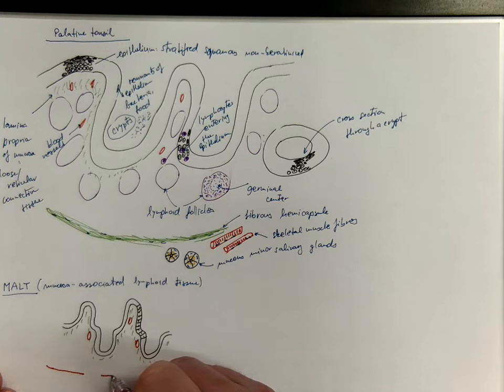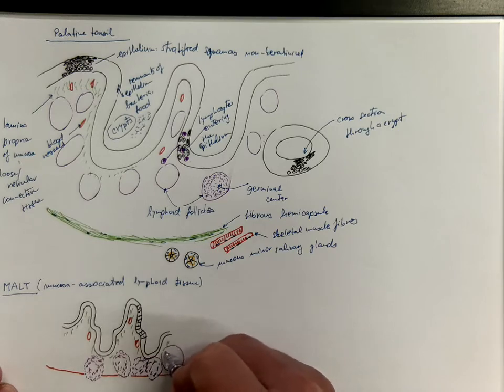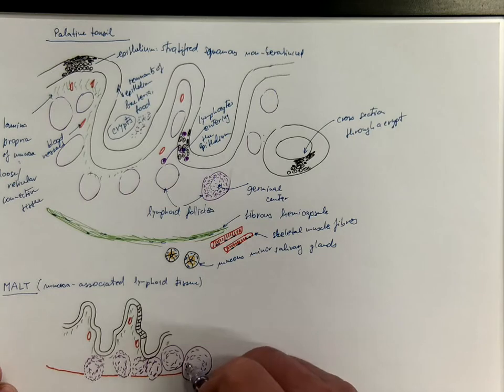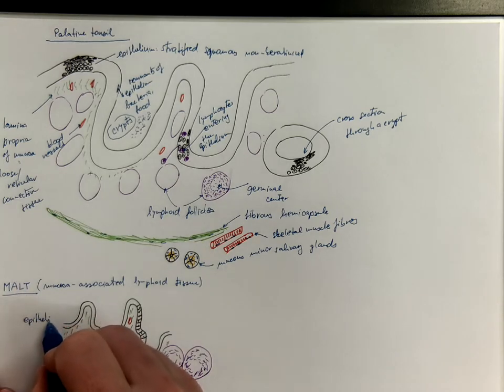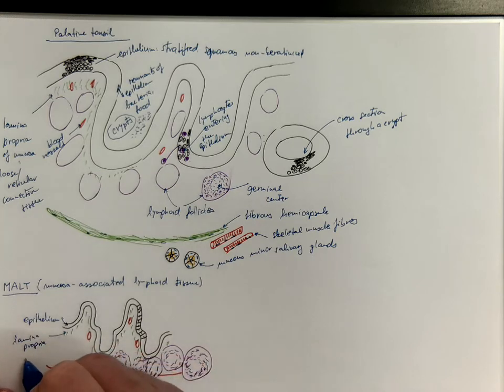But sometimes the lamina muscularis is not continuous because there are the lymphoid follicles here. Some of them are solitary accumulations of lymphocytes and some of them could be even aggregated. This will be the epithelium, this will be the lamina propria, this will be the lamina muscularis.